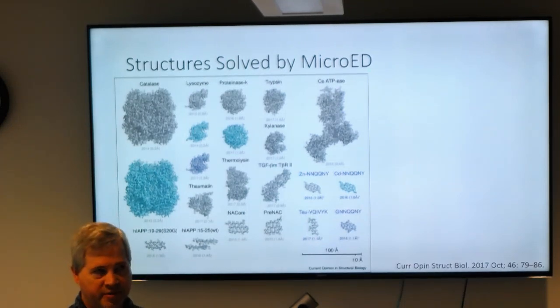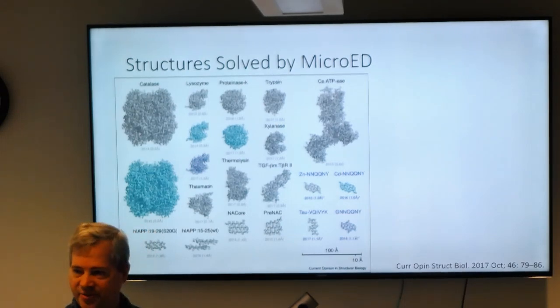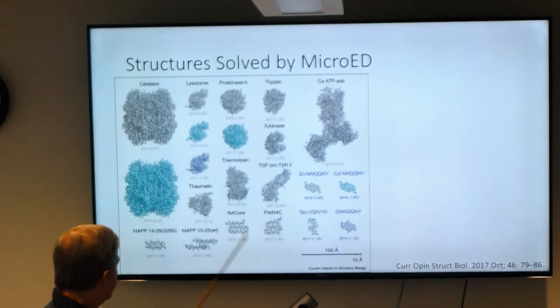The main thing of EM is single particle. If you're above 50 kD now, you might as well do single particle, I would say. But at first it all seemed to be to do with the amyloids and these beta kind of things. Yeah, I guess that's not true anymore. Yeah, I mean, they did it.